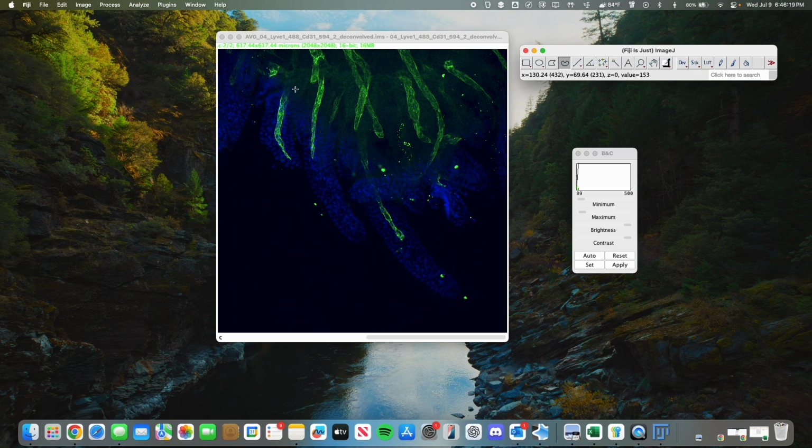So it looks like the base is somewhere around here. It's sometimes tough to tell, especially with all this extra noise. I can go ahead and try to remove it, but it doesn't really do too much of it. Actually, it helps a little bit. We can see a little bit here.